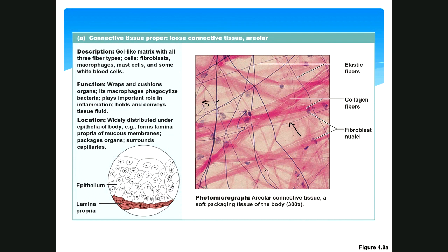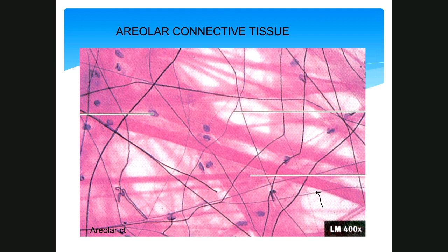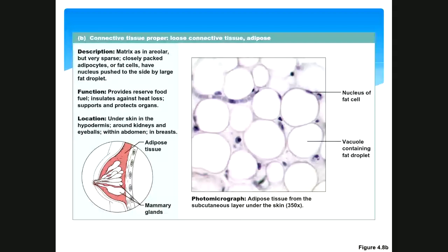And like this one, they're very faint. And they're hard to see. So if we look in here, it would be something like this or this. These really, really, really hard to see ones. They don't show up very well. Well, you can't see too much of that in here, but that's also what's in here, in between these adipose cells.